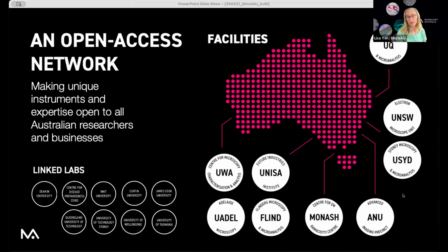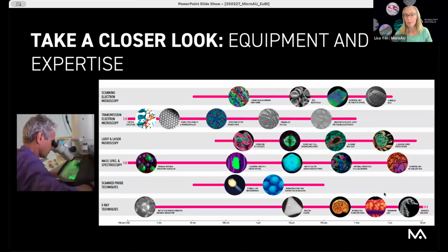So we do think about ways to try and communicate the importance of microscopy and bioimaging to both our funders, but also to our researchers. And so some of the way that we do that is try and take some of the micrographs, some of the images from our instruments, think about how to position them both in different techniques so that people can understand the breadth of the various techniques that we offer, but also the scales with which they're able to use those. So whether that's looking at atoms or proteins, right the way up through to animal skeletons. And I think that's got some synergies with Euro-BioImaging as well.